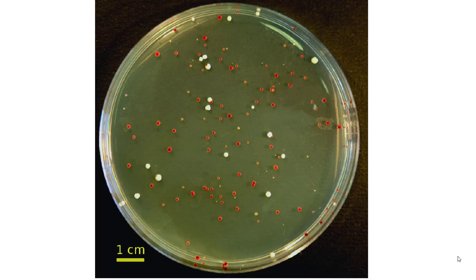And this picture shows you, after we incubate the plates, typically what we would see. We would see some red cells, usually quite a few red cells or just a few, and then some white. This plate has quite a few white, but it is the photo that I could find on Google. And so you get an idea that a lot of the cells are going to be killed, straight up killed by the UV. Just too much DNA damage, too much for the cell to survive.